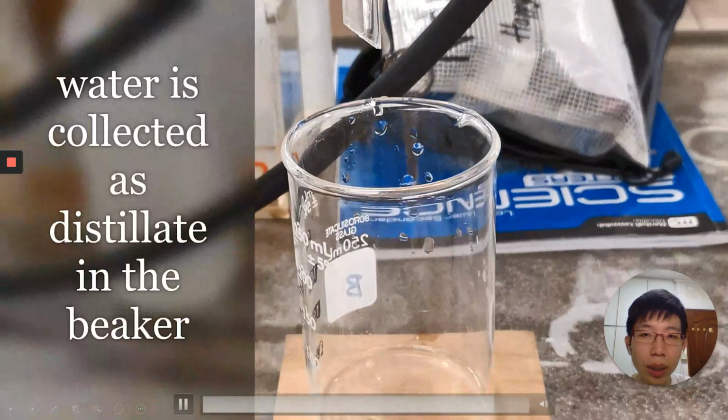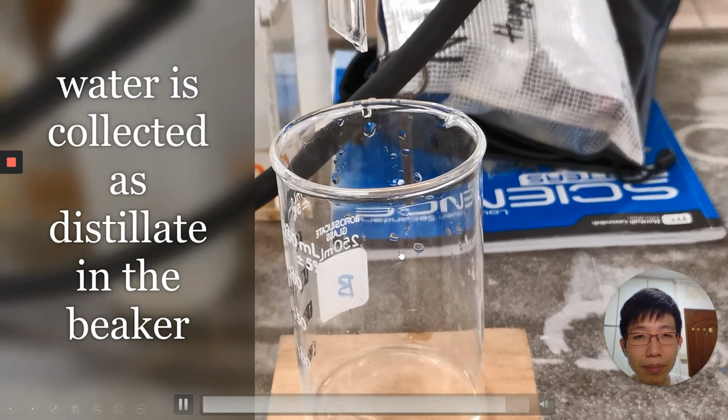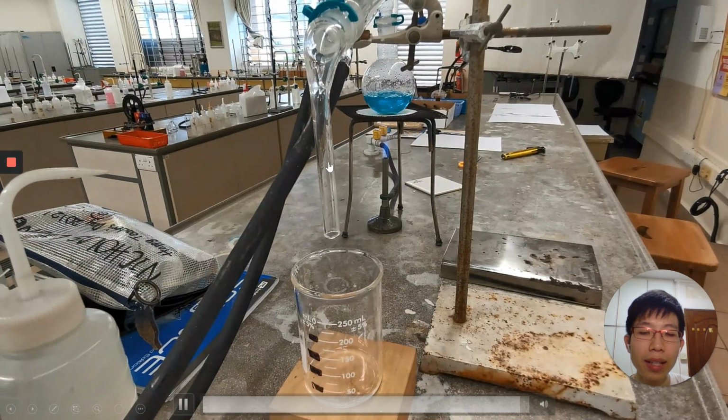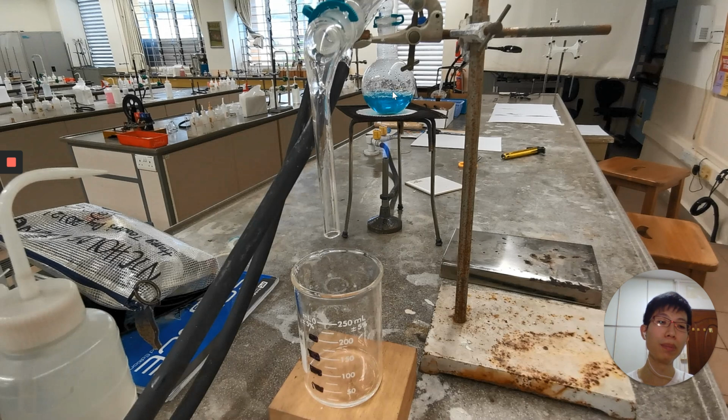And water is collected as distillate in the beaker. So as time goes by, you'll see more water being collected as distillate in the beaker. And you'll notice that the initial solution, the volume has decreased as more water has been removed or separated or distilled from the solution.